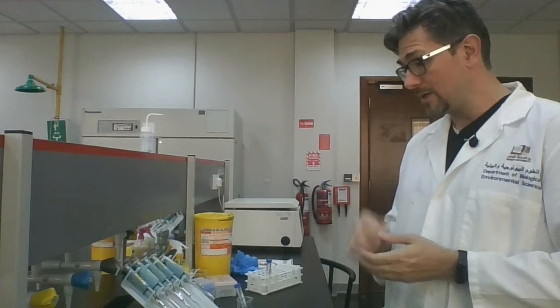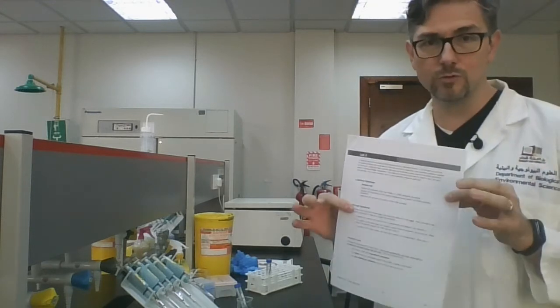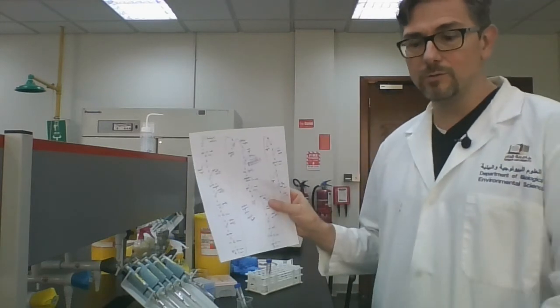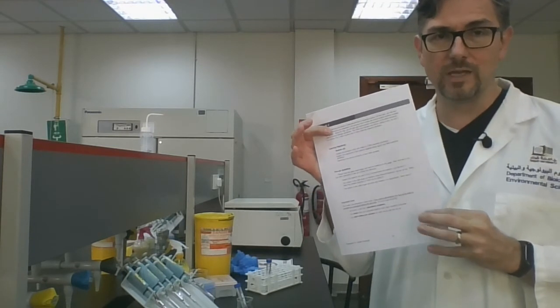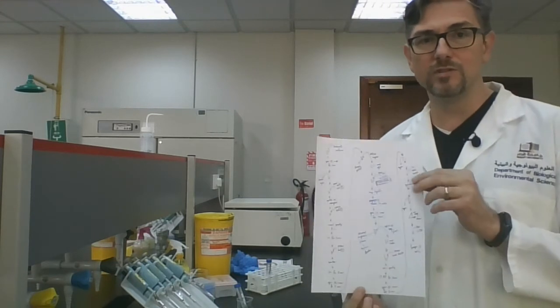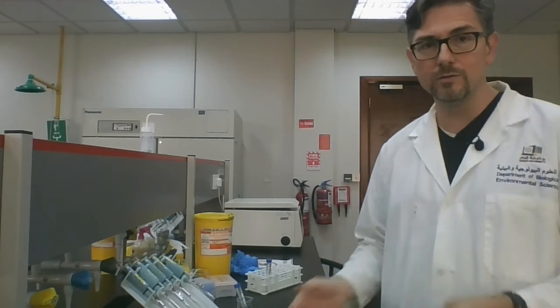Okay. Now, before we get started, I have printed off and read through my protocol. I have also used that protocol to make myself a flowchart so that I have step-by-step instructions of what I'll be doing next. I recommend having a flowchart ready with you because the protocol contains an explanation of why you're doing different steps. When you are actually doing this, it doesn't matter too much why you're doing it. You just want to know what the next step is, which is why having a flowchart, a single page sort of thing, is a much easier way to do this. So I suggest you have a flowchart ready to go before you get started. You can work on that before coming to the lab.